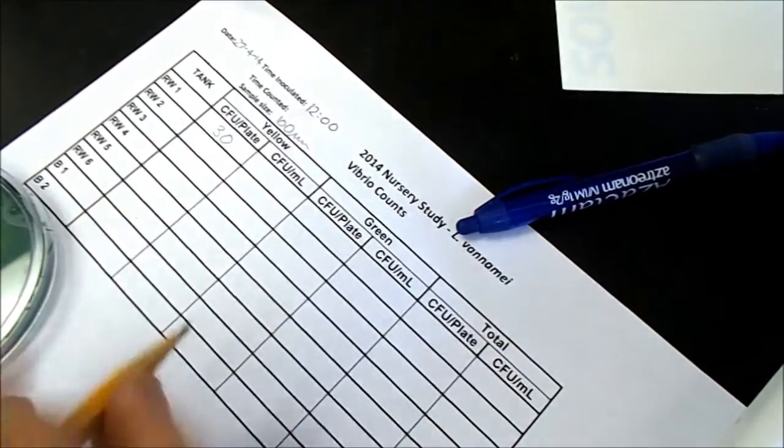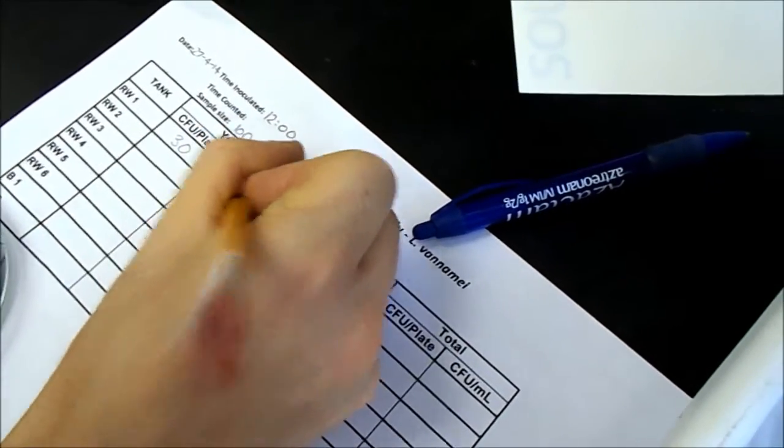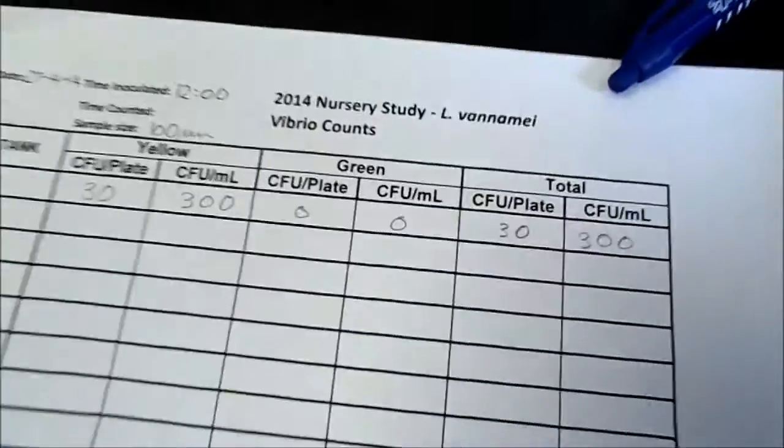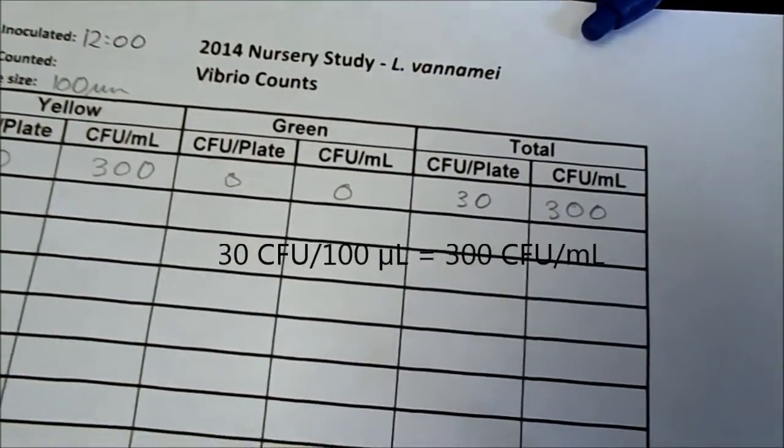Multiply by 10 to get the number per mil. So there's 300 yellow per mil. There's no green, which means our total in this particular tank or raceway is 300 colony forming units per mil.